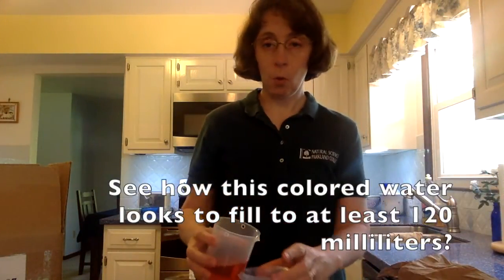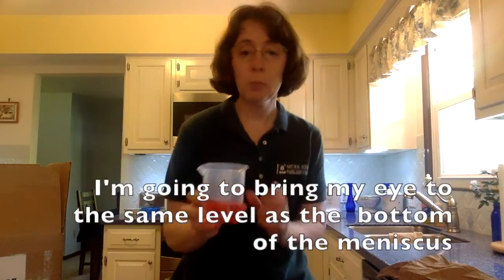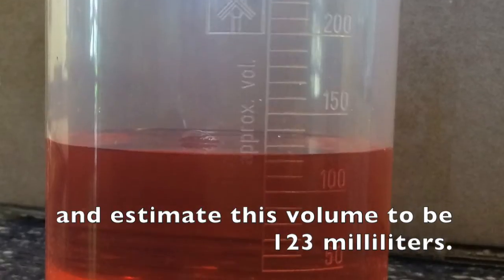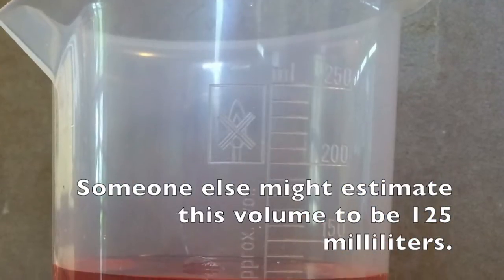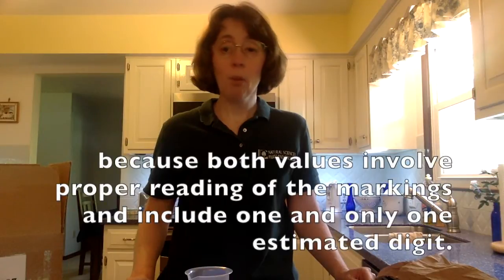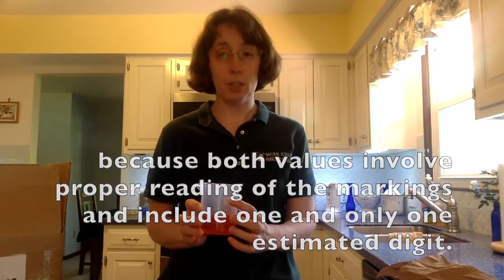See how this colored water looks to fill to at least 120 milliliters? I'm going to bring my eye to the same level as the bottom of the meniscus and estimate this volume to be 123 milliliters. Someone else might estimate this volume to be 125 milliliters. Both answers would be acceptable on a lab report because both values involve proper reading of the markings and include one and only one estimated digit.